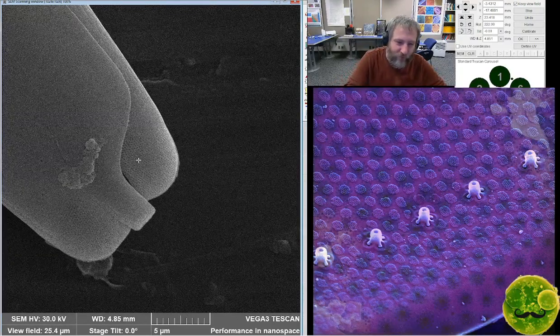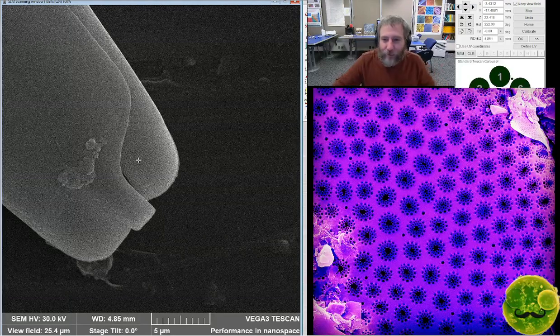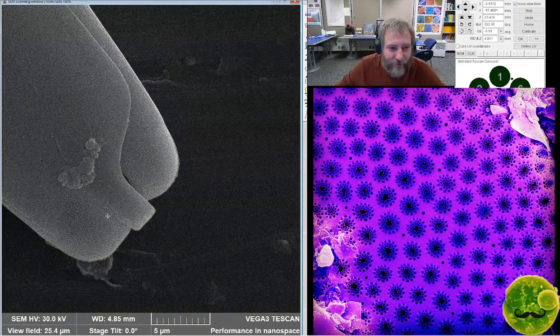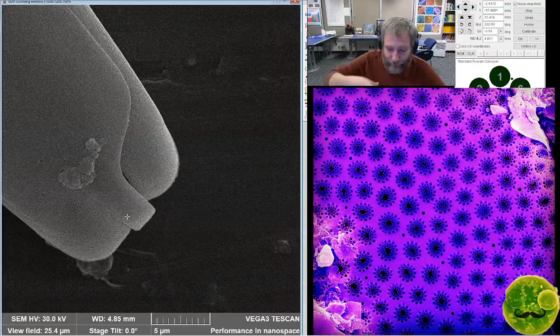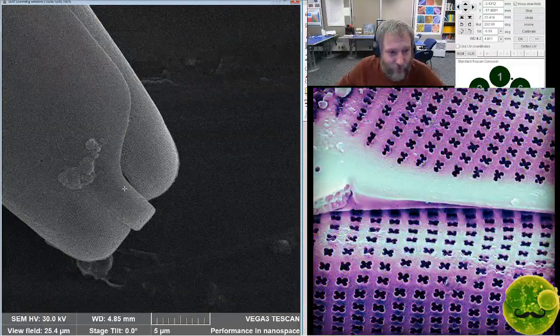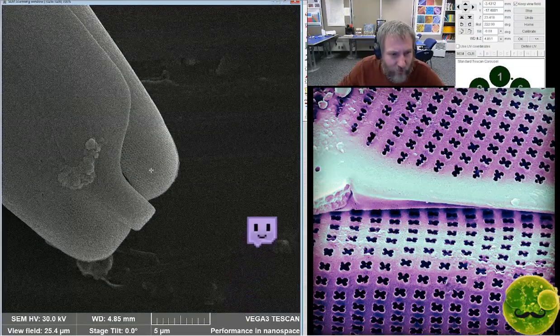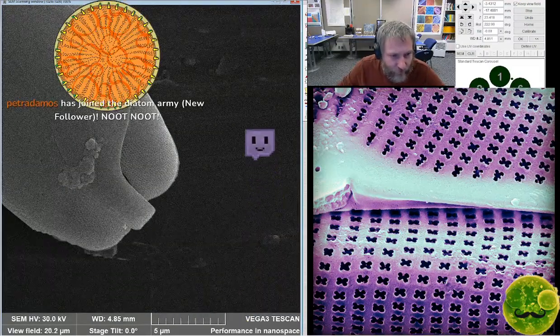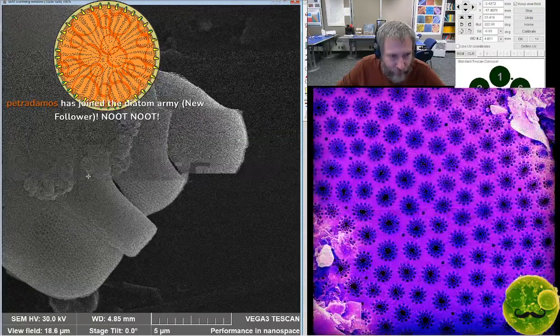And they grow these long sort of stalks. They live out on the end of the stalk. So that's why we call it the foot pole, because it's basically the bottom of the diatom. It doesn't look like a foot, but it is where the stalk comes out when they grow stalks, and gomphonemoid diatoms typically grow stalks. So we'll get a picture of the foot pole up close.